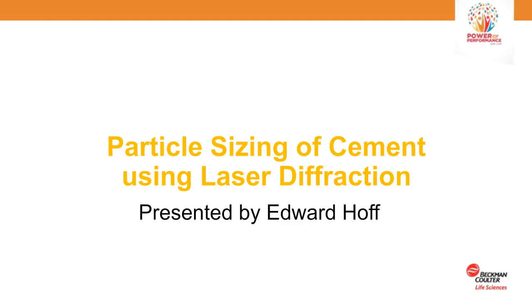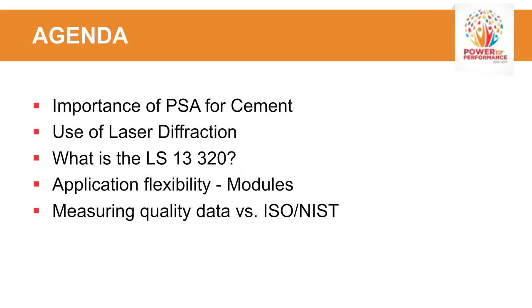Thank you, Sue. Today, as Sue mentioned, we'll be discussing particle sizing of cement using laser diffraction type instrumentation. The areas that we'll be discussing will be the importance of particle size analysis for cement, the use of laser diffraction, also the LS13320, which is Beckman Coulter's laser diffraction system, and the importance of how this is transitioned in the marketplace.